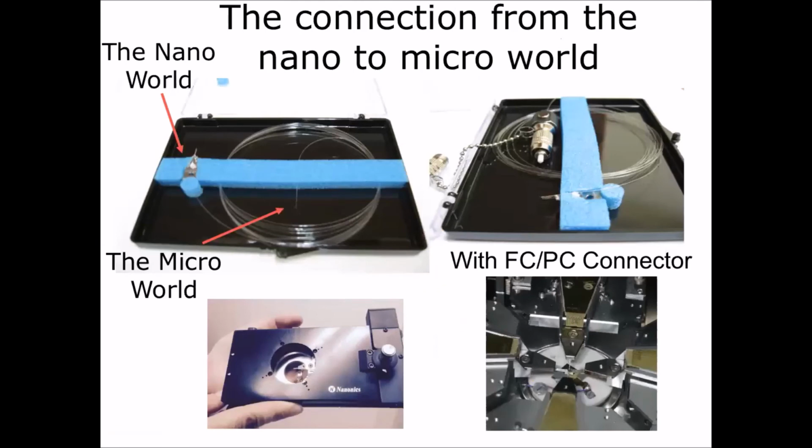This is what a probe looks like. A probe is a long fiber. One end is the micro world. One end is the nano world. Okay? You put that nano world onto your samples, onto your tip mount, and these are our scanners. Okay? Very thin scanners. You can even have two scanners with a completely free access. So this is not parallel imaging. This is a place where precision, fast actuation will help. Absolutely, absolutely, and you'll see what I mean by that in a moment.